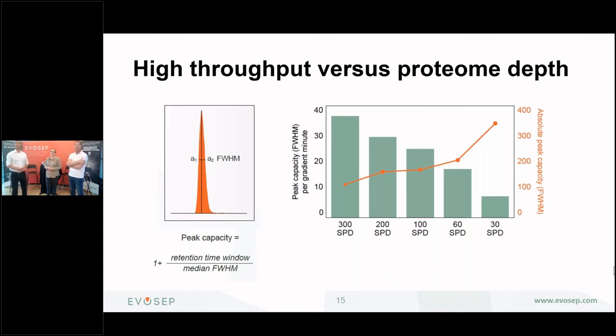But as you said, is that actually the most efficient use of mass spec time? No. Right? I mean, the best use of mass spec time is actually going in the reverse direction to shorter and shorter gradients, because that makes the mass spec more efficient in utilizing the peak capacity in the gradient. Exactly. You can't have it all. And if you look a couple of generations back in mass specs, that's where the benefits were, in the shorter gradients where you can really utilize the super fast scan speed. And you can only move in the direction of speed because the mass specs are becoming faster, and the way we use them is much more efficient.